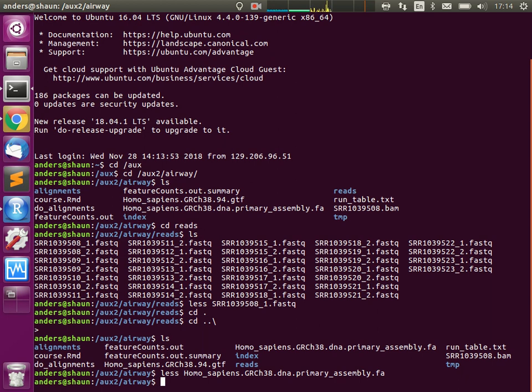Since when do we have Illumina now? Quite a while by now. The issue of how to choose an aligner for you is hence: A, is it fast enough for your choices? B, does it run on your computer? Which typically does not mean that you need an expensive computer, but all of these things usually run once you have 16 gigabytes, which is standard for most computers unless you buy a really cheap laptop.